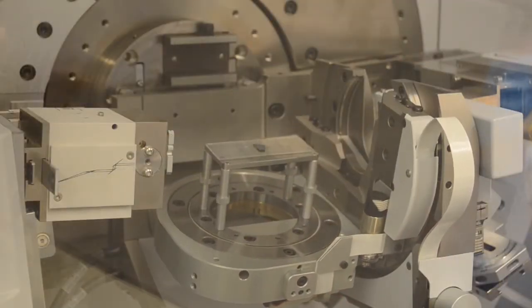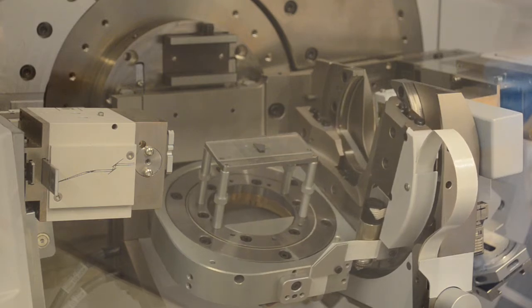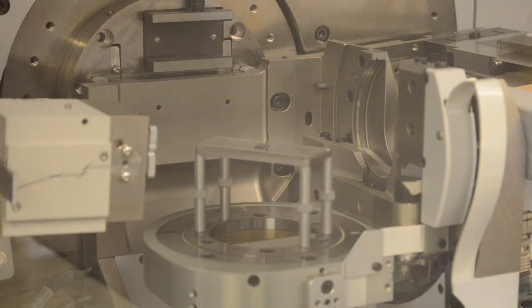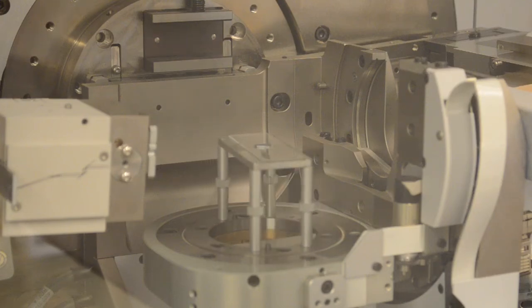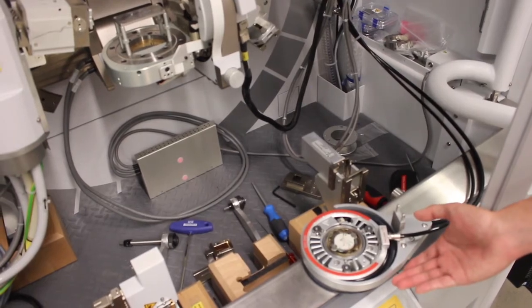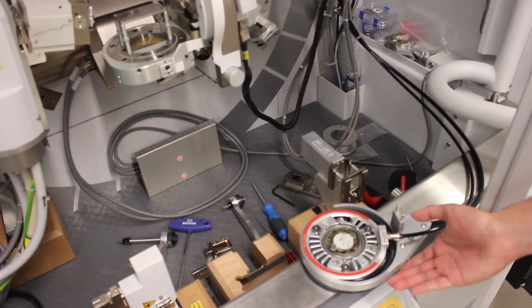We can perform a large variety of measurements, including theta-two-theta scan, phi scan, rocking curve, and pole figures. With our newly purchased high-temperature sample stage, we are now able to perform in-situ high-temperature XRD.